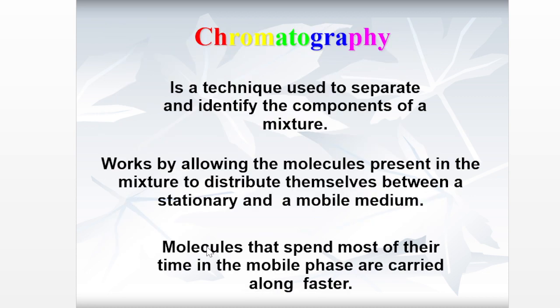If we look into the definition of chromatography, basically chromatography is a separation technique which is used to separate and identify the components of a mixture. Chromatography works on the principle of allowing the molecules present in a mixture to distribute themselves between a stationary and a mobile medium. Molecules that spend most of their time in the mobile phase are carried along faster.